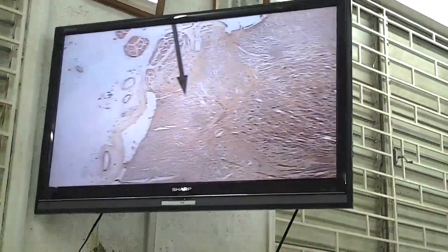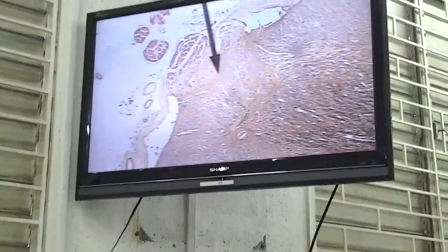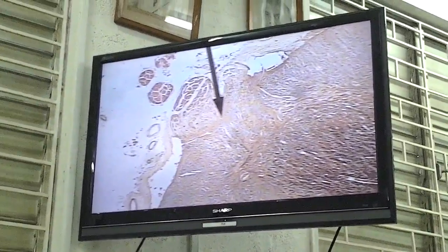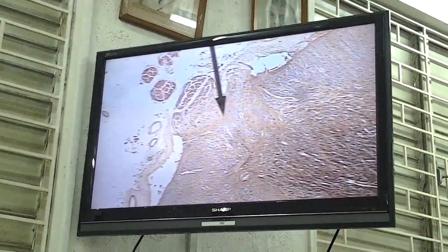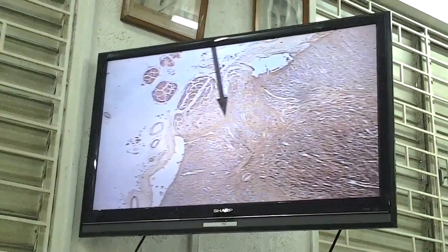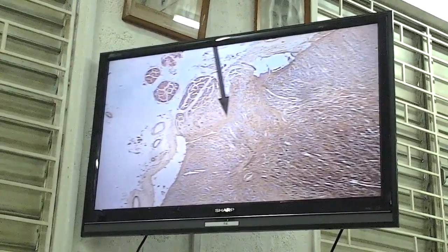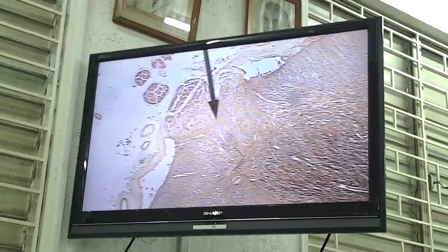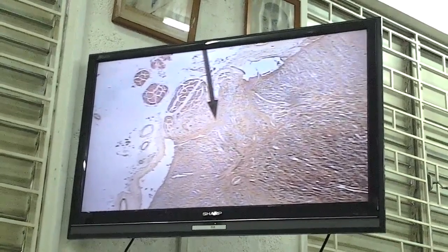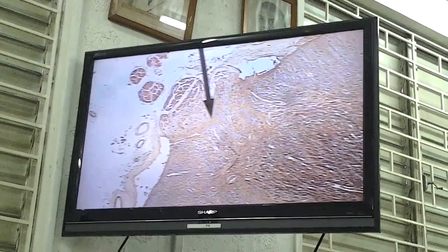Right at the tip here, just as the dorsal root comes in, the dorsal root meets an area known as the what? Jessica, what does the dorsal root first encounter? What's the name of that layer that it encounters first? The marginal zone. The tract of Lissauer, isn't that so? The posterolateral tract of Lissauer.